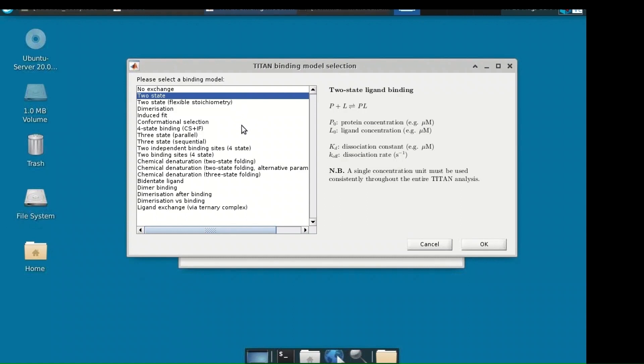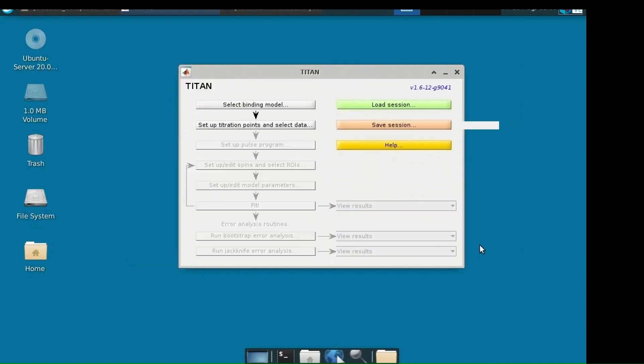Choose a binding model, which is a microscopic association mechanism to which the experimental data is fitted. Binding models convert concentrations and model parameters into exchange rates for NMR calculations. The standard one people go for is 2-state, which describes a simple binding process. Start simple — if things are not fitting, try exploring other models to understand why.